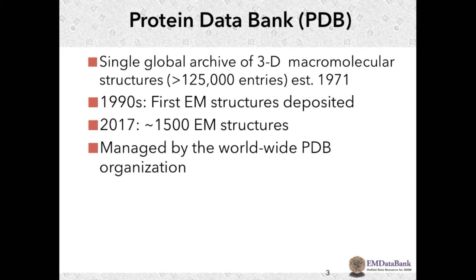So the Protein DataBank, it's the single global archive of 3D macromolecular structures, so it's all coordinates. And there's over 125,000 entries, and it was established in 1971. And as you, of course, will know, there's X-ray, NMR, and EM structures in there. The first EM structures were deposited in the 1990s, bacteriorhodopsin, 2D crystal structures. Now in this year, we have about 1,500 EM structures and growing fast.